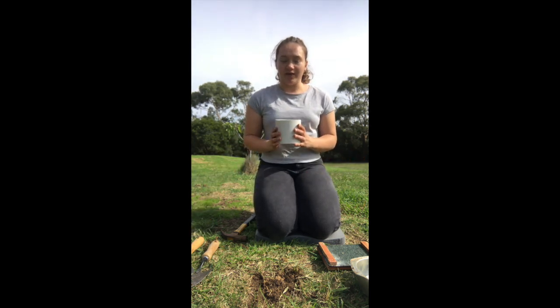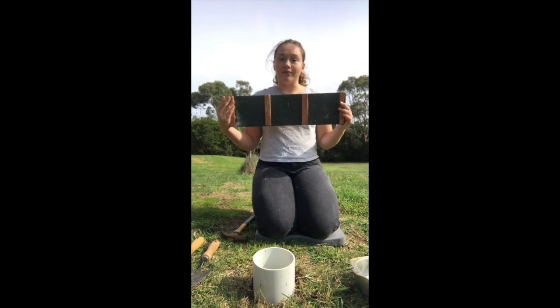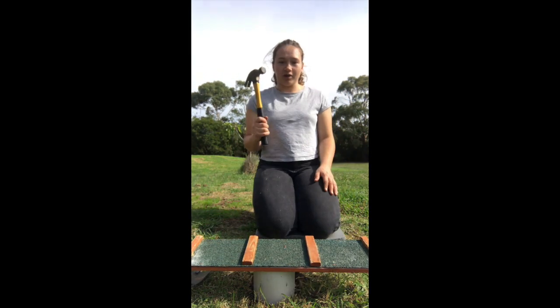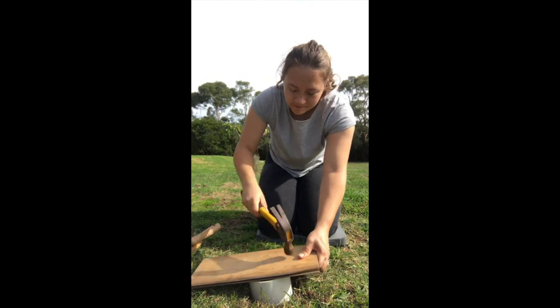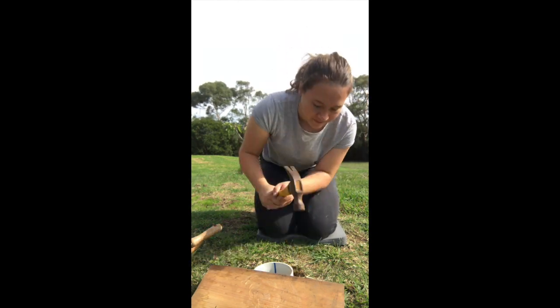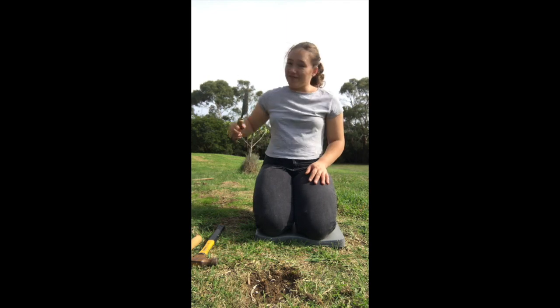Begin by getting your PVC pipe and placing it where you want to take your soil sample from. Next, grab your wood. In this case, it's a guinea pig ramp because that's all I could find, and place it on top of your piping. Next, we're going to grab our hammer and begin hammering down, trying to get that pipe into the soil. Once you've gotten that pipe deep into the ground, use your trowel, dig it back up.